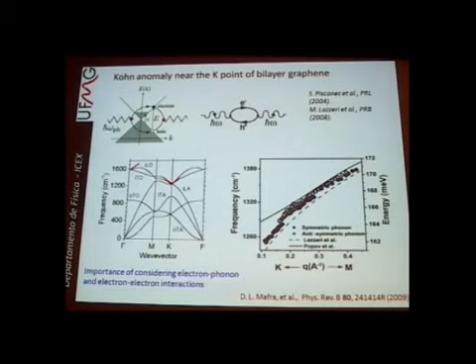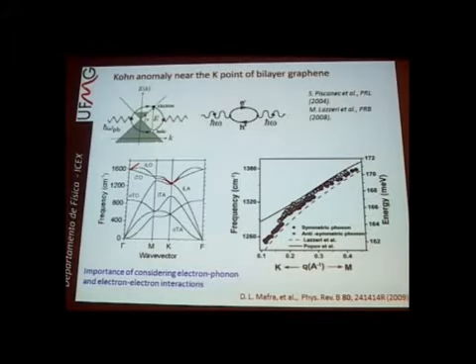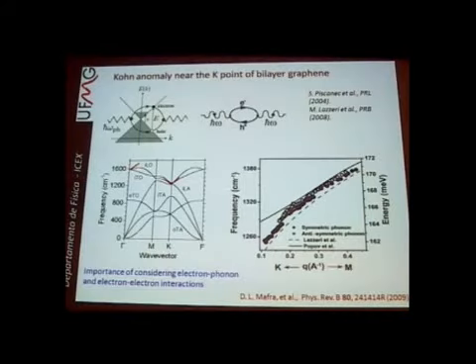Another point is the detection of the Kohn anomaly. The Kohn anomaly is very well studied at the gamma point, because the G band occurs at the gamma point, where you have this Kohn anomaly happening. But at the K point, it's very difficult to reach by optical process. Here we use near-infrared Raman data to probe the decrease in the phonon frequency due to electron-phonon interactions near the K point, the so-called Kohn anomaly.